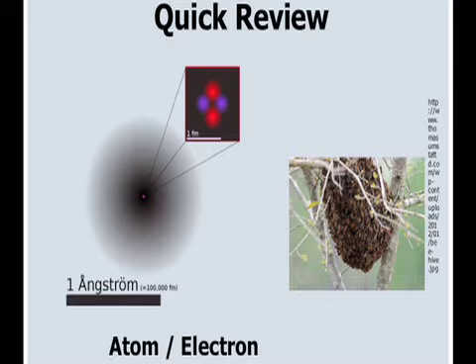And if you want, for example, to remove electrons from this cloud, you can do that. Same way, if you poke this beehive, you can get a very nice group of bees out of their home. Basically, this is what we do in electron microscopy. We want to remove these electrons from those atoms. And instead of having a light beam in my microscope, I want to have an electron beam.